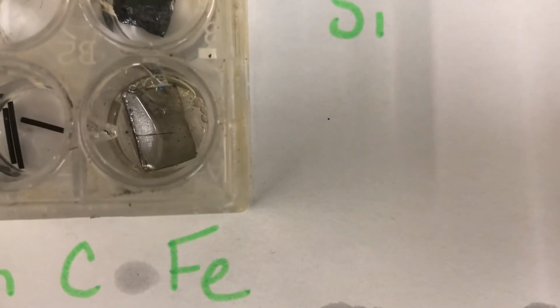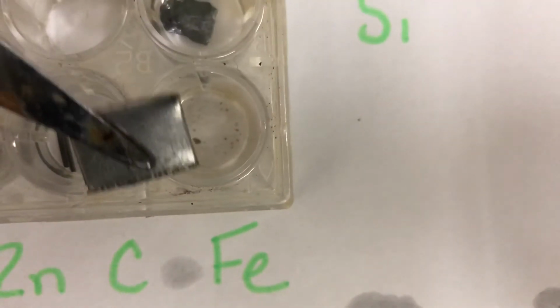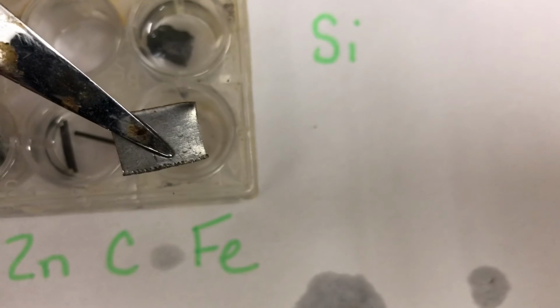As far as iron, it looks like the edges a little bit are starting to turn black or brown. So there's some type of reaction that's happening with iron. And last but not least, let's look at silicon.